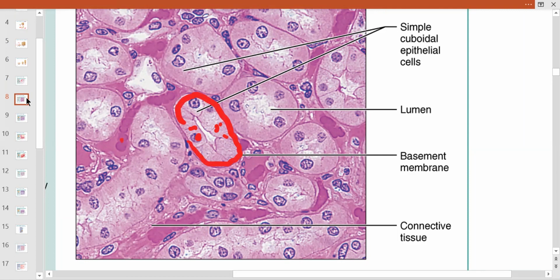Then you have like blood vessels in between. This is blood cells in here. And you see this right here? That's the lumen. The lumen, the space where the filtrate in the kidneys is going through, whether the pee-pee is going to go into the Chipotle bathroom, it's going to come back into the blood and increase my blood volume.